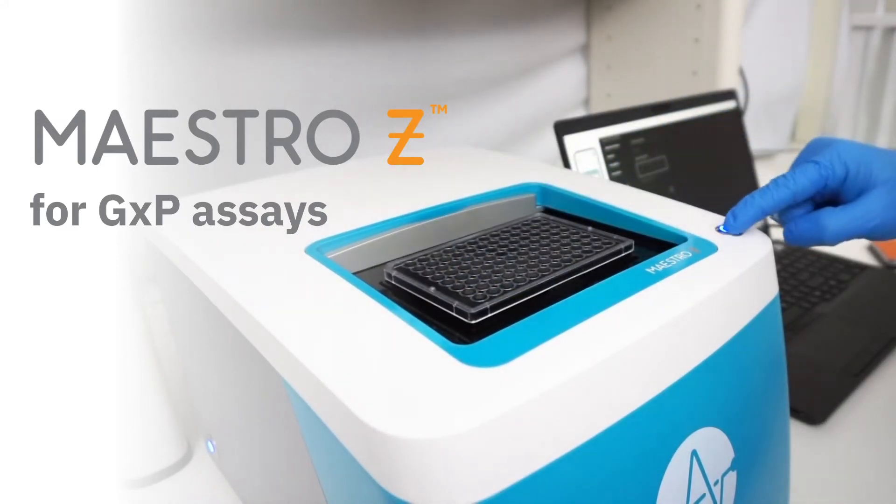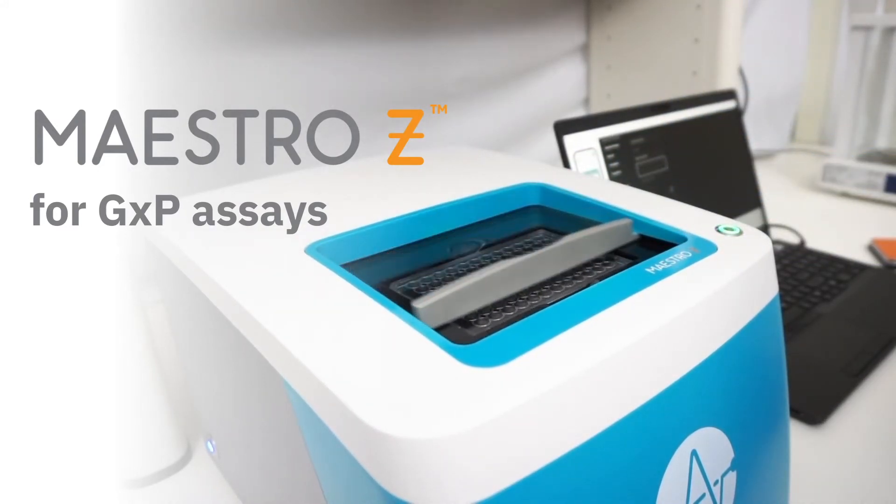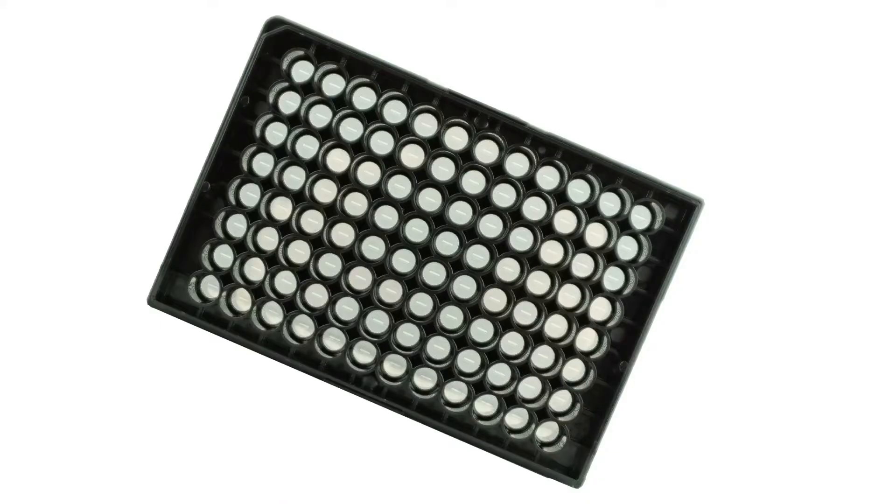Announcing the Maestro Z system, now for GXP assays. The Maestro Z system lets you track your cell biology label-free and in real-time, using sensitive microelectrodes embedded in the 96-well microplate.